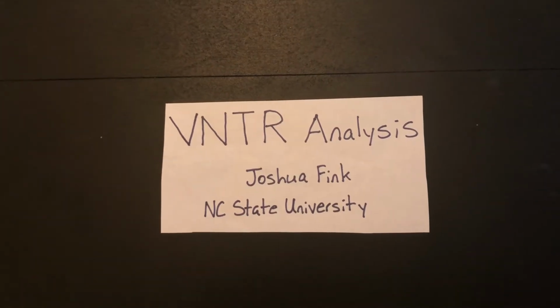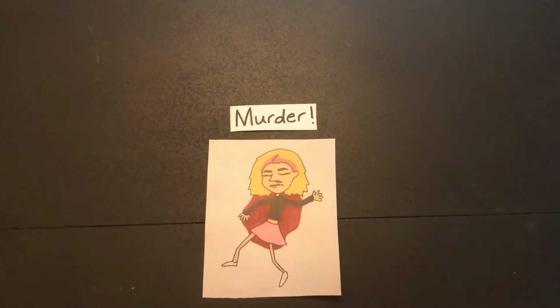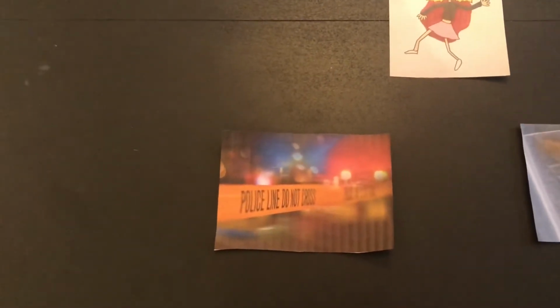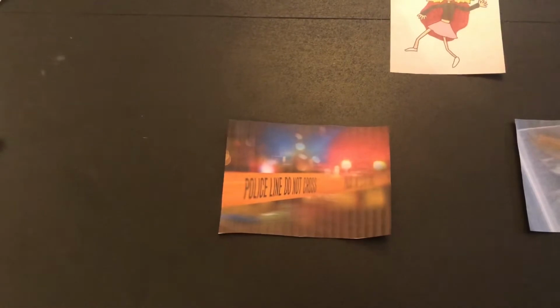In this video, we will be doing a VNTR analysis. Oh no, Whitney has been murdered! The police and a detective are on the scene to collect any DNA evidence they can find to figure out who could be the murderer.